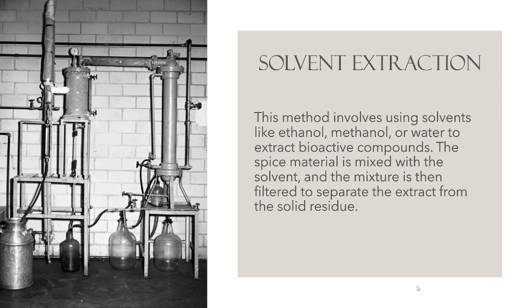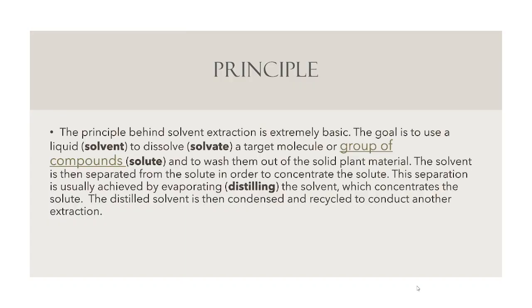Solvent extraction is a method based on using different solvents like ethanol, methanol, or water to extract bioactive compounds. The spice material is mixed with the solvent and the mixture is then filtered to separate the extract from the solid residue. The principle of solvent extraction.